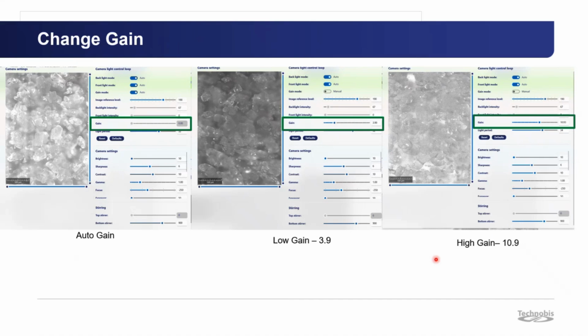It should be noted as well, these steps need to be done at the beginning of every experiment, because once the experiment is completed, they all revert back to default. So it might be worth making a note somewhere of the camera settings used in your experiment in order to then reuse them at a later date.